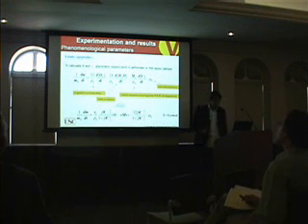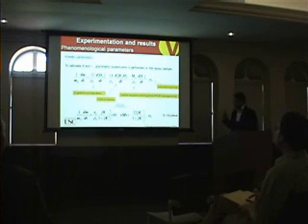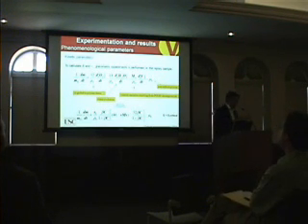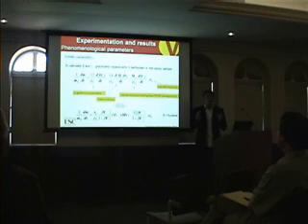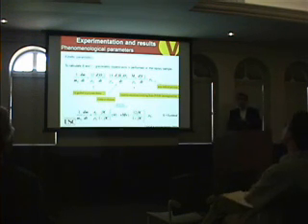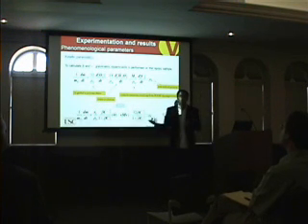Then, in order to measure those reaction constants, we use the fact that when you put some samples of polymer in an oven, you're going to lose weight. When you lose weight, it's due to two different things. First of all, it's due to oxidation of your matrix. Second of all, it's due to thermal degradation of the matrix.